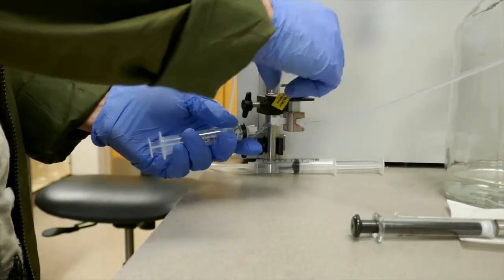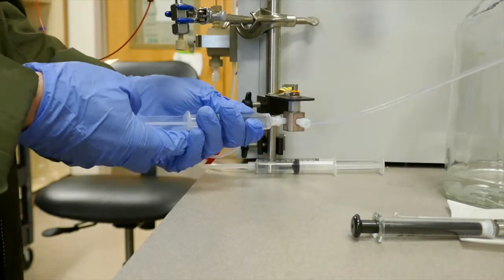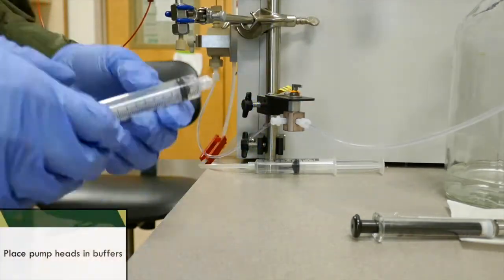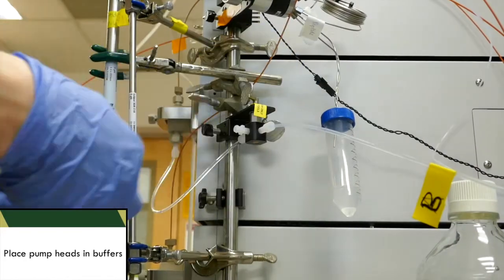You can then place the pump heads in the correct solutions and cover with the solvent containers and tinfoil. The B solution should contain 100% acetonitrile.